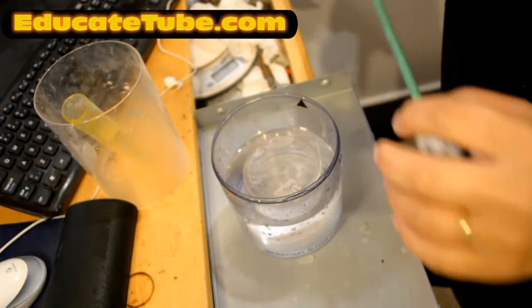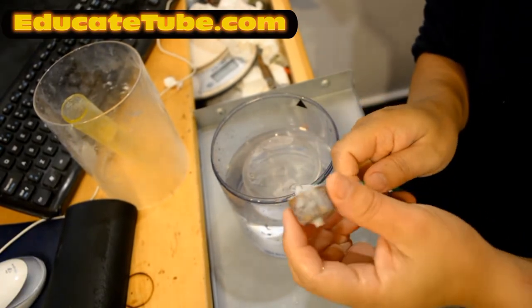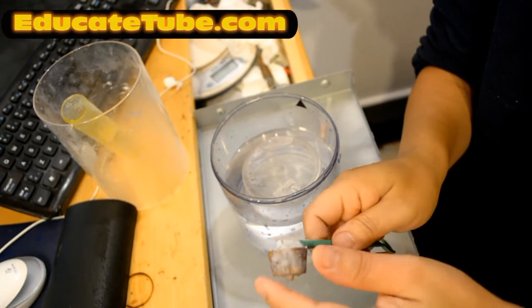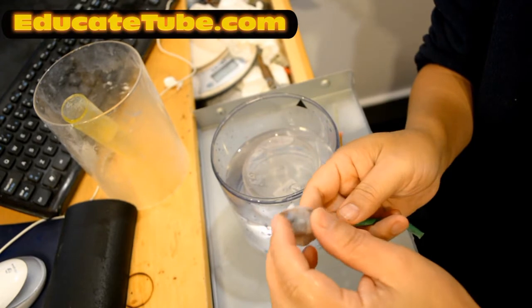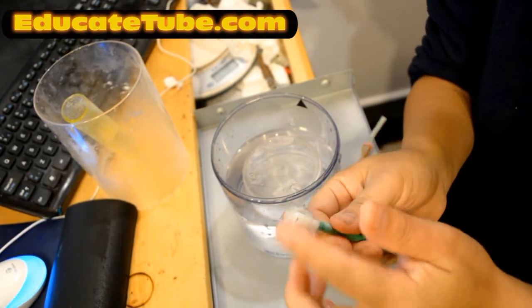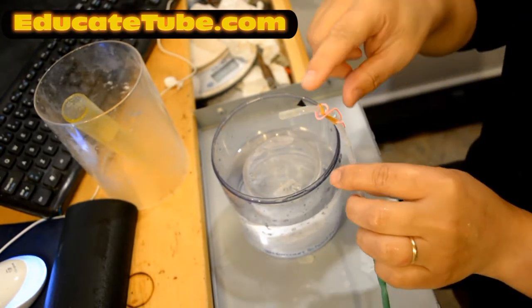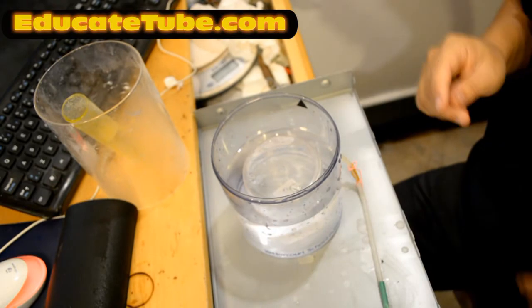Okay, so this is the third attempt. Now the only difference I made is that I sealed it with wax for my stopper. I don't have a rubber stopper. This is a cork, so it was porous. It was leaking the gas, so I put wax around it to seal it more tightly. Okay, so that's the difference. The ending's still the same. I bend it with a paper clip, give it that curve, and we're ready to go.